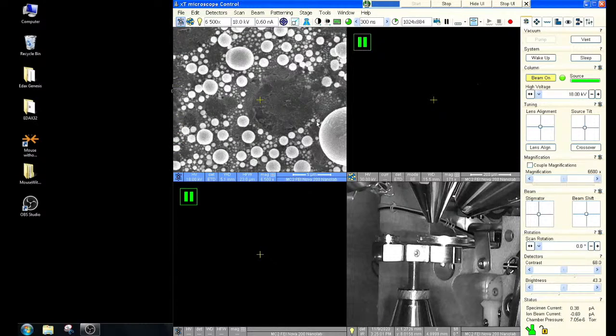So let's go over to the Genesis software. What I'm going to do here is crop my Nova display. We want to do a filter, a crop filter.